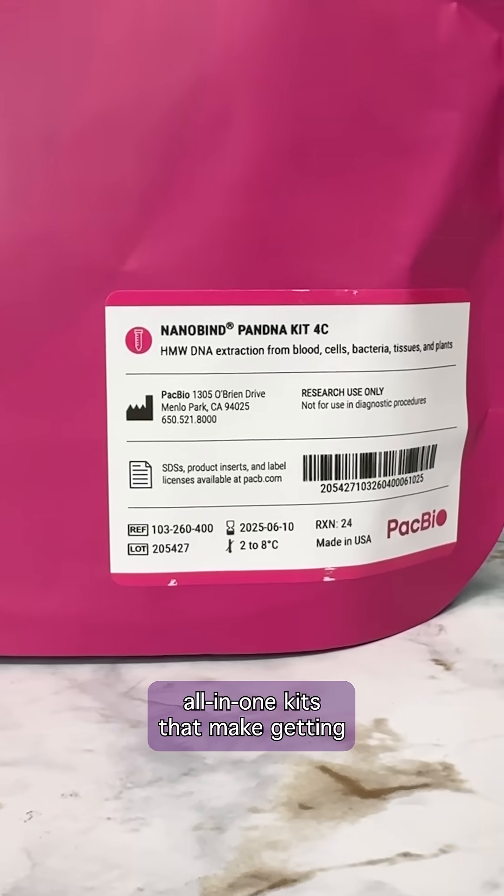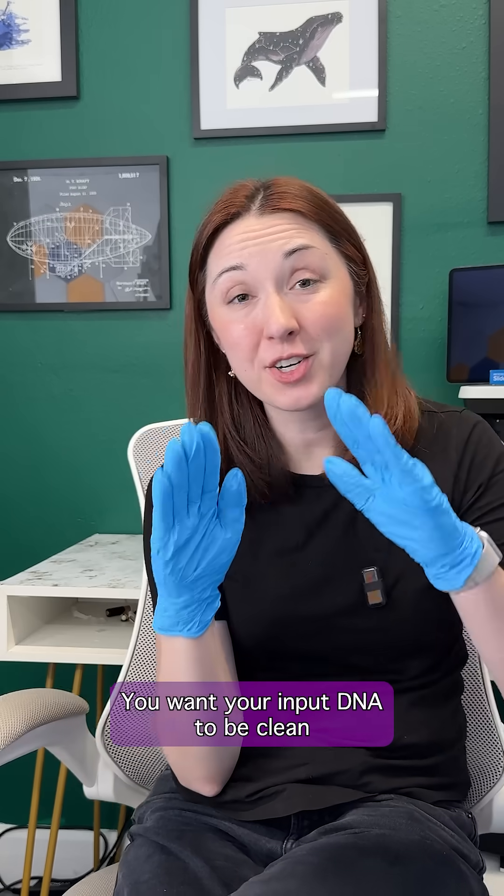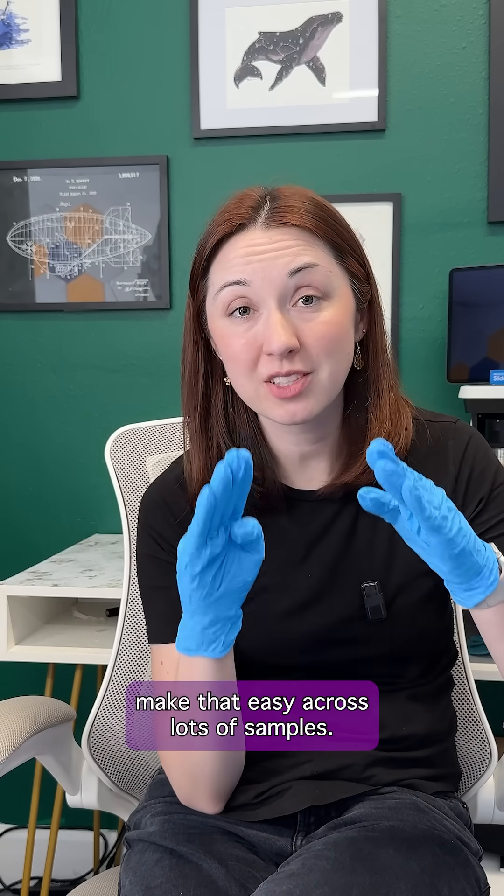The nanobind kits are all-in-one kits that make getting long-read-ready DNA super easy. You want your input DNA to be clean and high quality, and these nanobind kits make that easy across lots of samples.